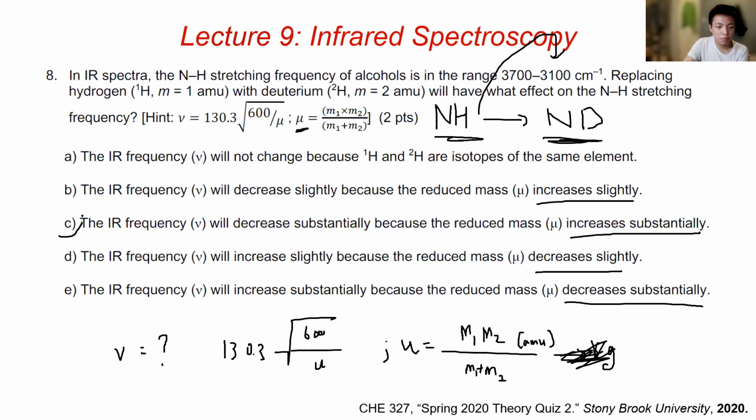Yep, it's C. Can anyone tell me what was the wave number you guys calculated? But yeah, after calculation, you guys should have around 2,400 wave number.